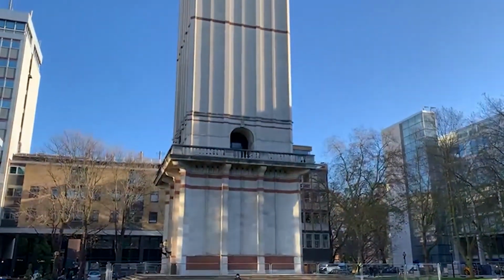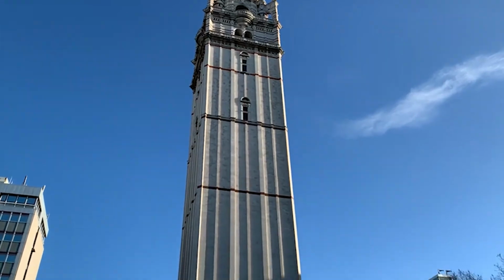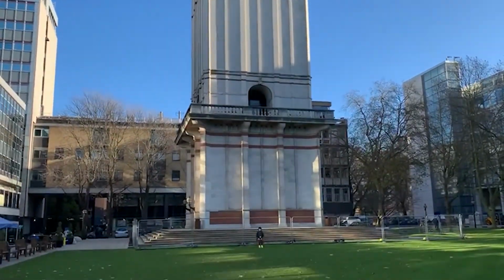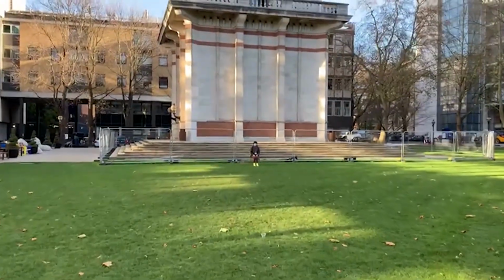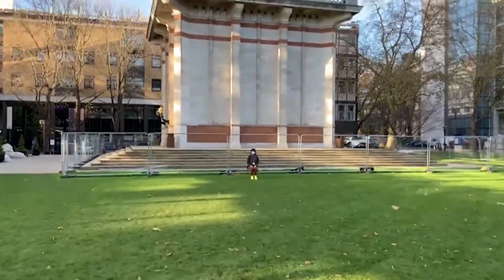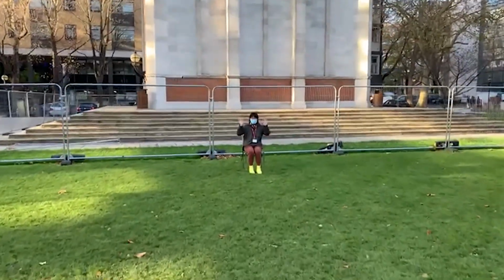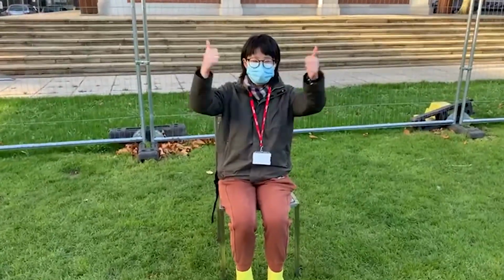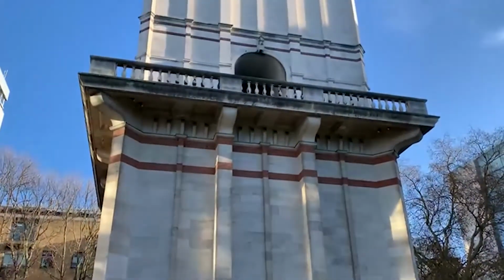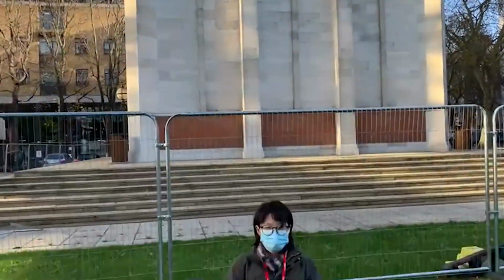Luckily, the scanning electron microscope is an alternative to light microscopy, which is much better in these areas. In the electron microscope, electrons behave as waves. These waves have much shorter wavelength than visible light, by 100,000 times. This allows us to see an extremely high resolution into a world that was previously hidden to us, with features as small as 1 nanometer. This is up to 200 times smaller than optical microscopes, or the same difference between the Empire State Building and a desk chair.